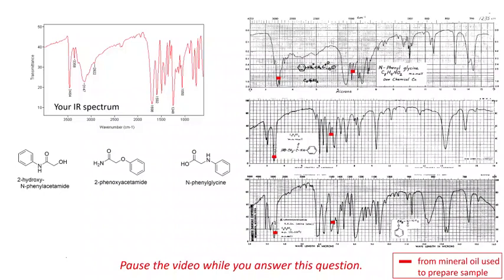There are many ways of doing this, but my read of the top spectrum is that it doesn't really match. In our spectrum, we're seeing a sharp peak at 3460 some. That's either an NH or an OH. And we're seeing a fairly large peak here. This little spike, notice that, 3358, that is essentially exactly double of that. So that's our harmonic, that's called the overtone, and we don't have to worry about that.